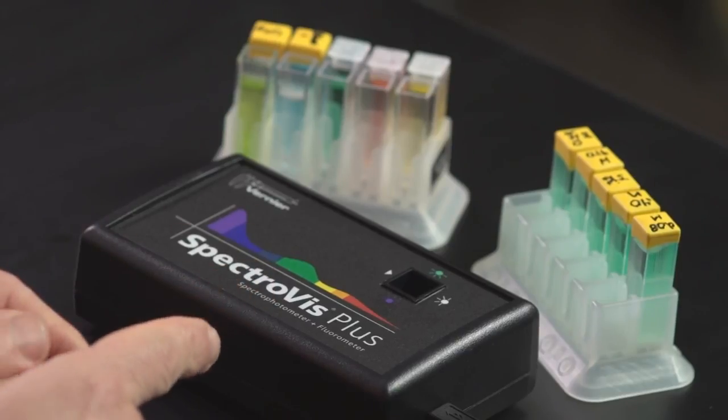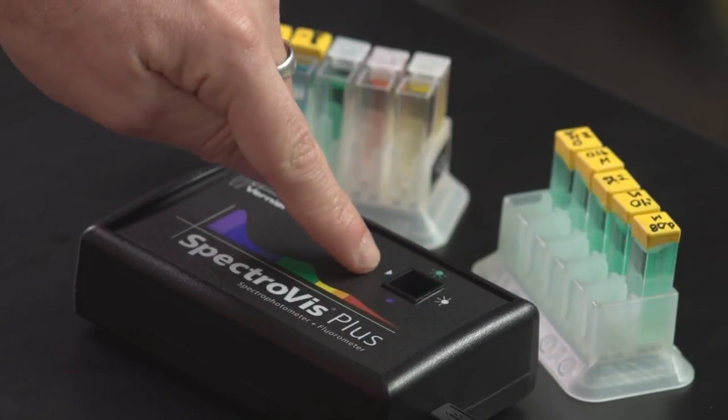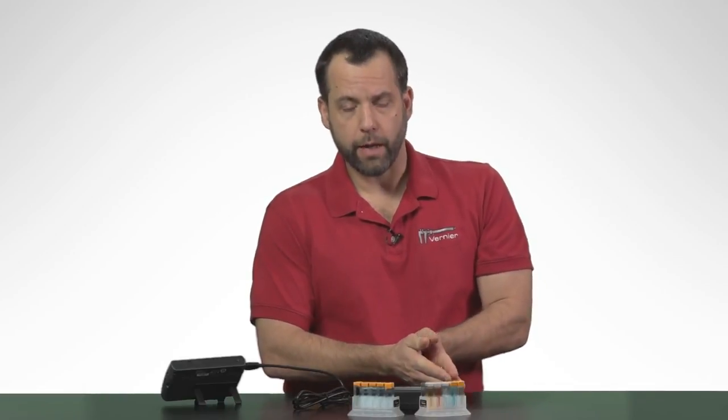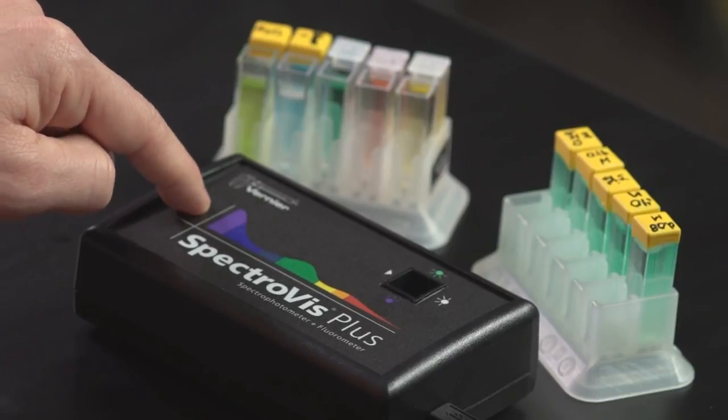How this device actually works is there's a little light source right here, and the light travels through the cuvette. It goes through a little diffraction grating, and after it goes through the diffraction grating, that light — that little rainbow of color — is spread across a little detector in the back of the device. And that little detector is what can show us all of these wavelengths simultaneously.